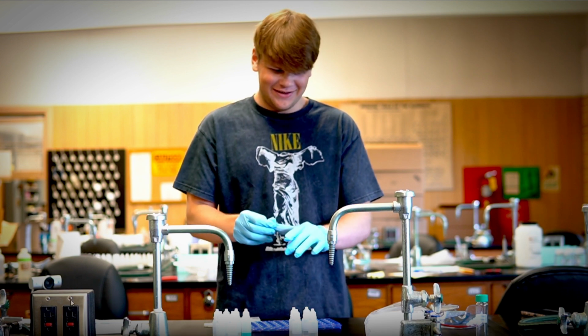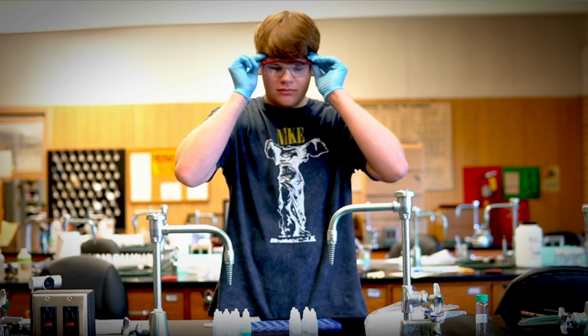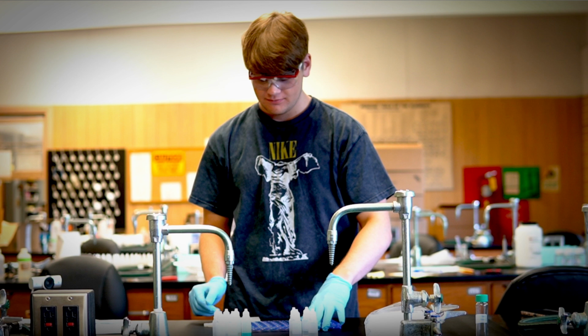And after you get started, make sure that you have what you need for today's lab. You're going to need test tubes. You should also have the solutions that are needed for today's lab. There are 6 solutions that we are testing, and then the 4 testing solutions as well. Your manual should list all of the chemicals needed. You also need a test tube rack and some test tubes.